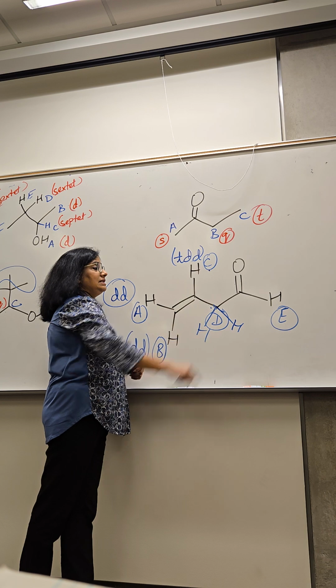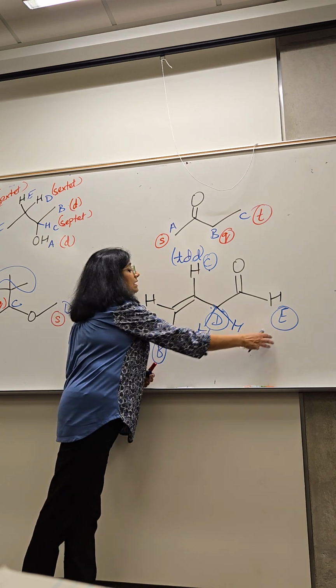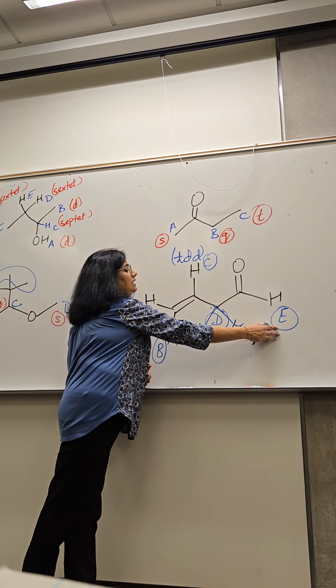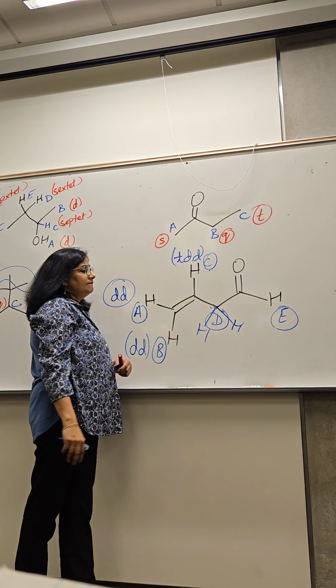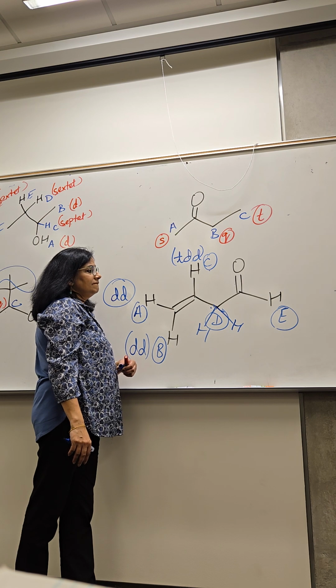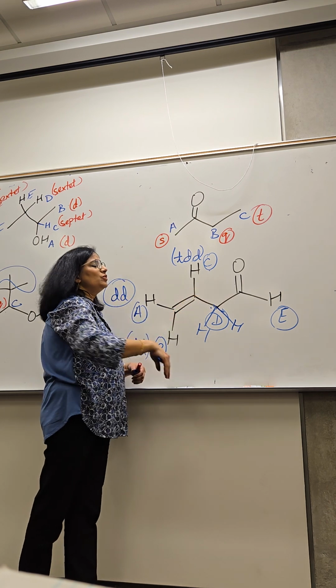Is D coupling with C? Yeah. Is D coupling with E? Yeah. But is DC equal to DE? No. Is it? Oh, yeah, it is. Yeah, they're just signal when there are pi bonds. Okay, fine. So what is the coupling?